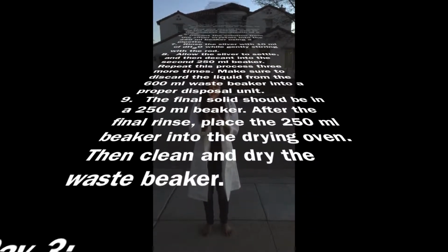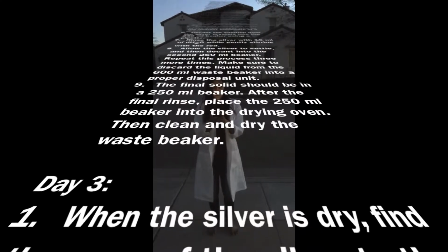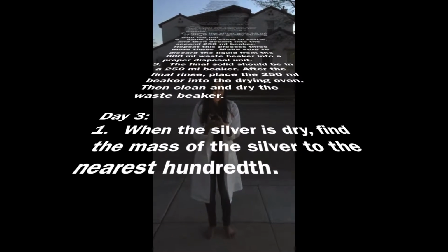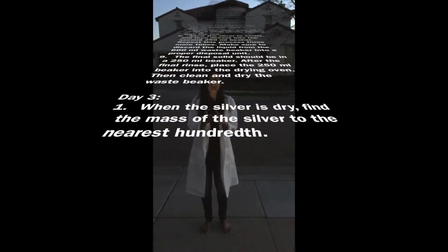and then decant into the second 250 milliliter beaker. Repeat this process 3 more times. Make sure to discard the liquid from the 600 milliliter waste beaker into a proper disposal unit.